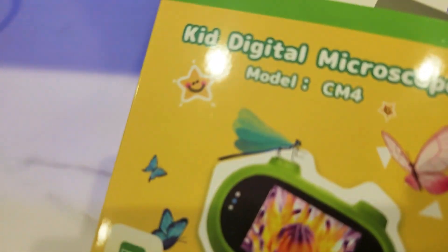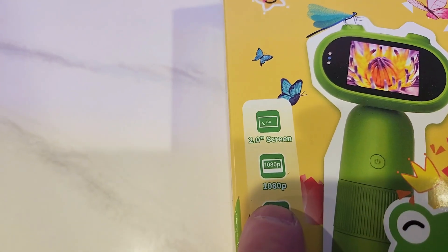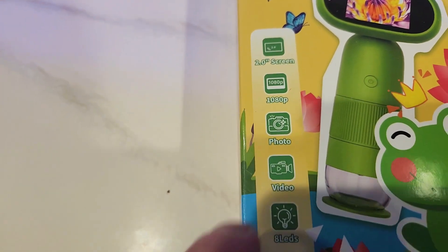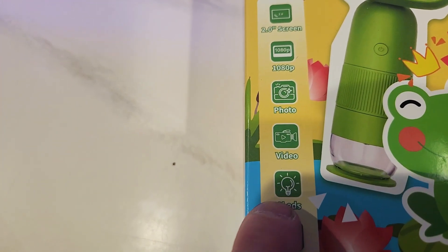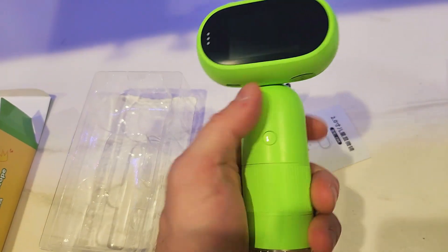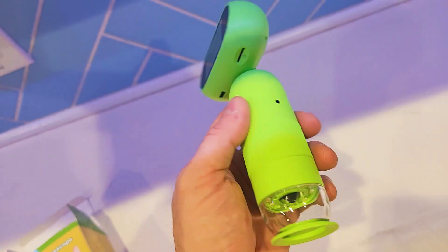Today we're going to look at this kid's digital microscope. It's got a 2-inch built-in screen. It records at 1080p. It takes stills and video. It's got 8 LEDs to illuminate whatever you're looking at, and it's sort of for a 3-plus year old. My kid is extremely inquisitive. It's nice to hold, it looks like a frog, and it stands. So let's go over some of the features on here.